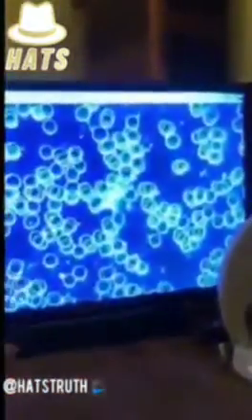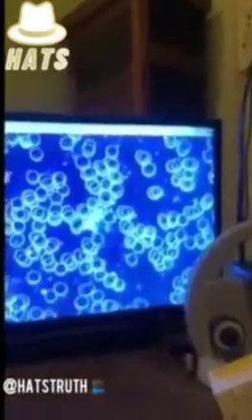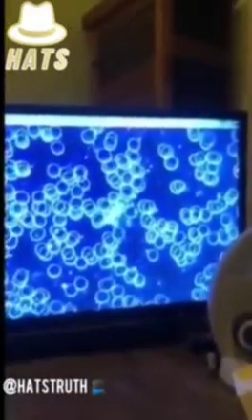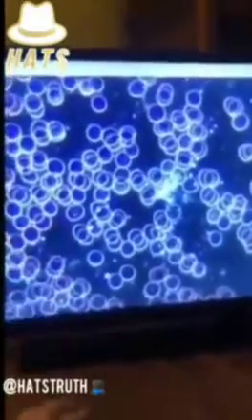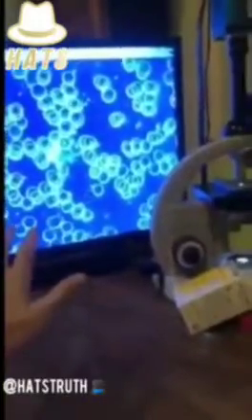And what we can see is less aggregation. This was tested a while ago, right? This was put under a while ago. And we're seeing the quality of the blood cell intact. So it's not damaged, it's good quality blood cells. Yeah, absolutely. And this is an example of good blood cells, okay?